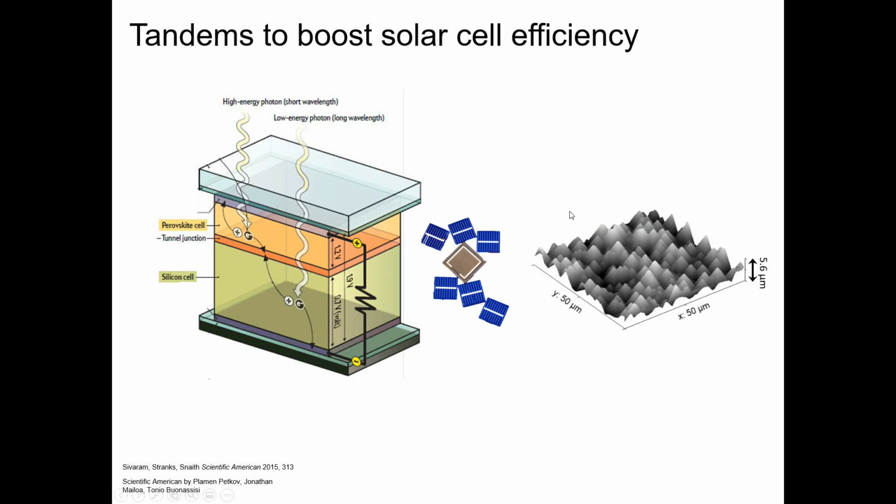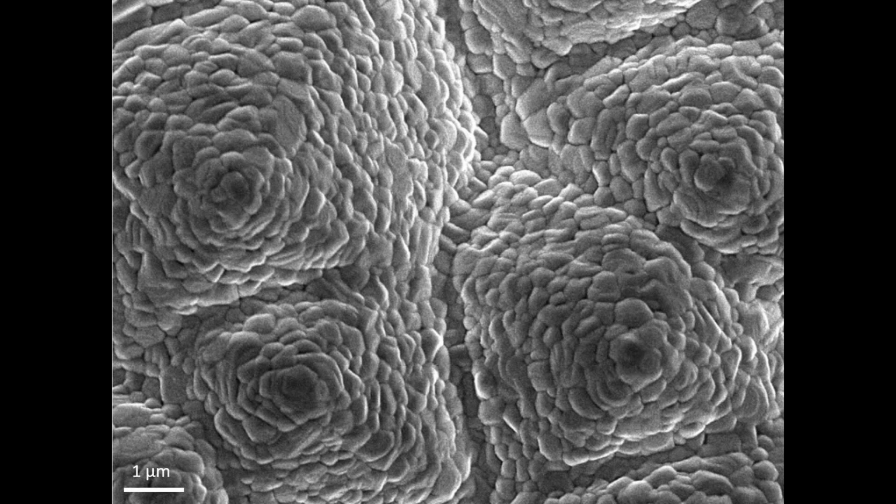Well, because perovskite can be solution processed, it's actually not so hard. What we're looking at here is a scanning electron microscopy image, top-down view now. So these are the tips of the pyramids, and we can see that they go out to the bases.